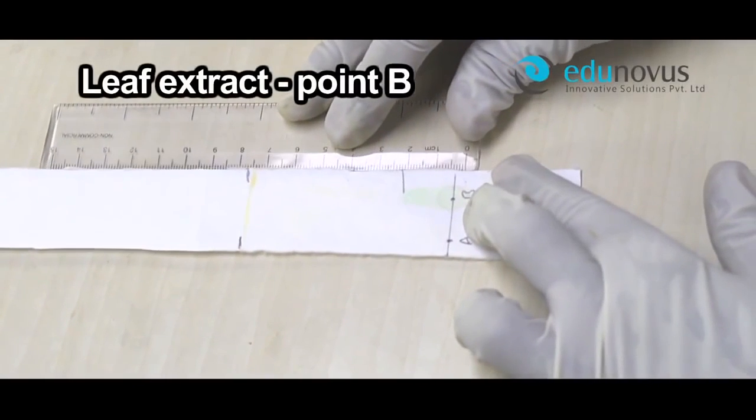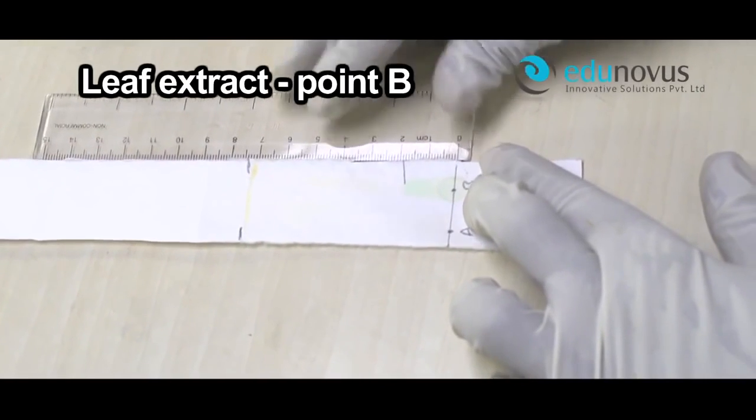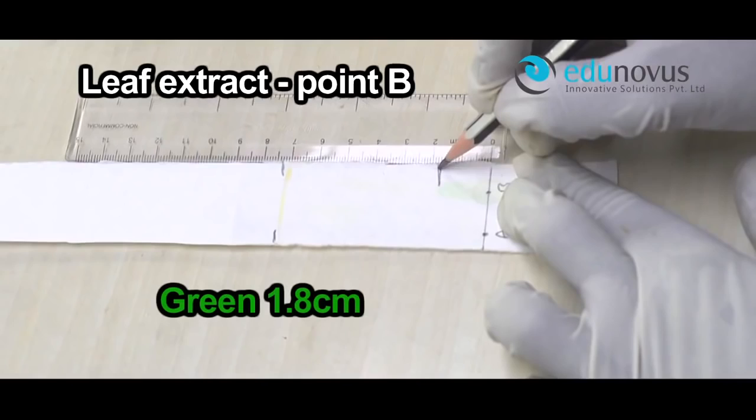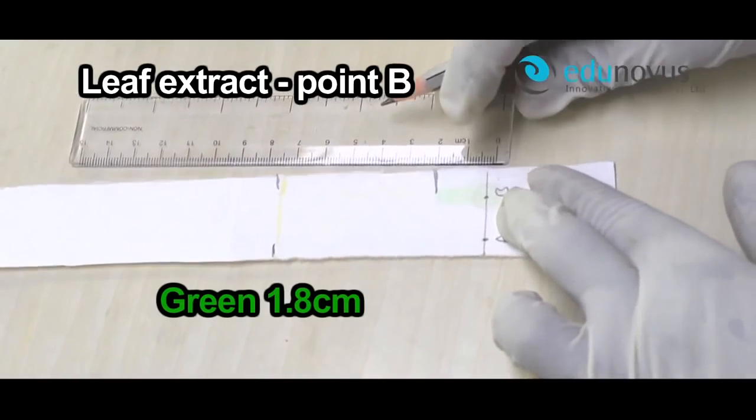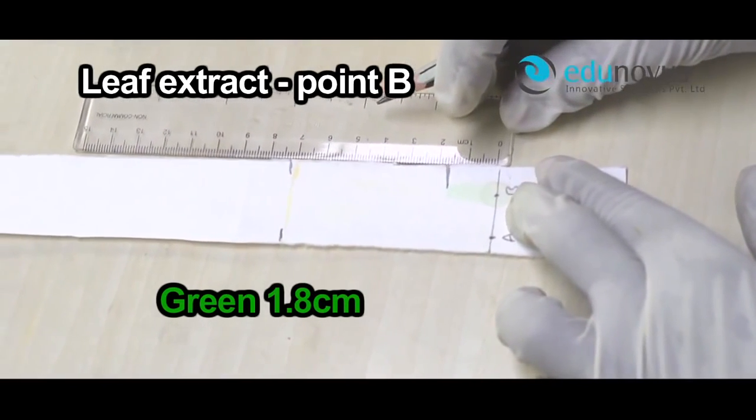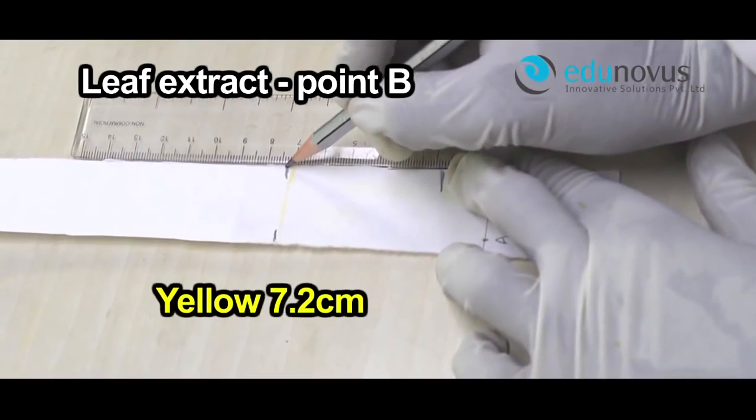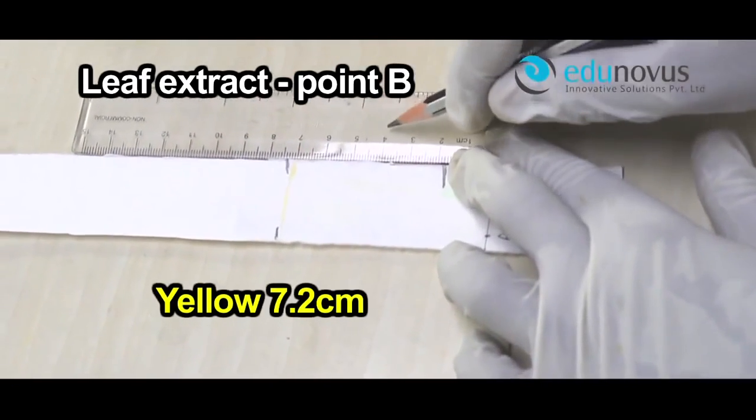In the case of leaf extract point B, we find two color spots: yellow and green. The distance traveled by the green spot is 1.8 cm. The distance traveled by the yellow spot is 7.2 cm.